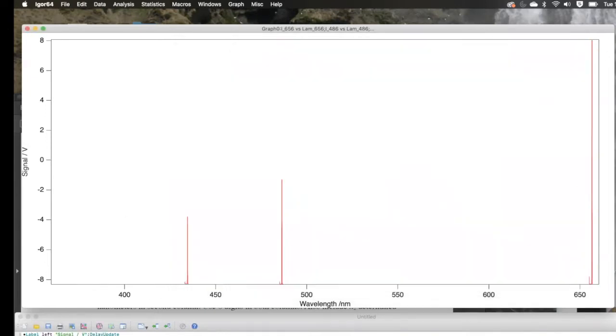We're going to want to fill it. You can see that they're getting close. They're losing intensity as we're going out to the blue. They're also getting closer together. All right, good. We've got something that looks like a spectrum there.